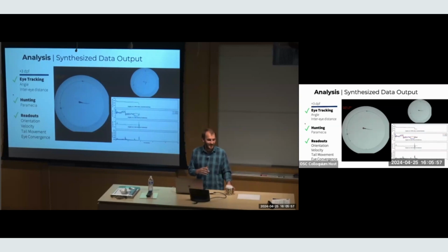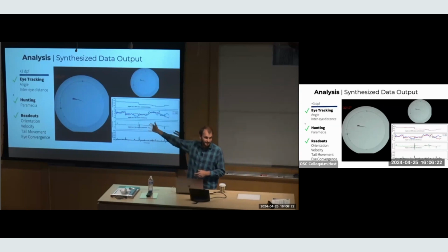Yes. What makes it necessary to have the wide field of view that you couldn't do by rastering? Is it signals that are going so fast that it's faster than the rastering could do? Absolutely. So in this example where they're all in different wells, the existing approach is just to raster one at a time, right? And if you want to do a hunting assay, which no one really ever does, it's kind of a new assay, you want to watch this behavior for like 10 minutes. So if you're going to raster, you're going to watch 10 minutes at each of 96 wells.